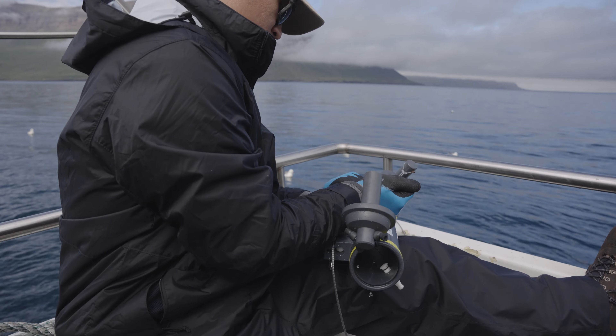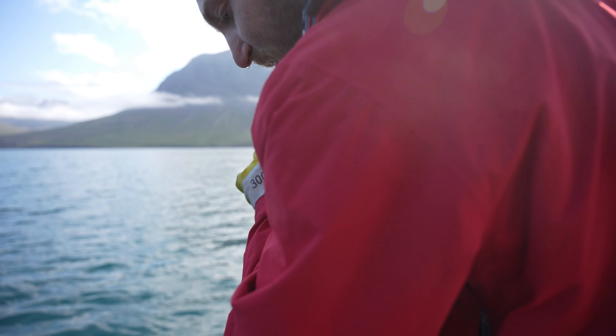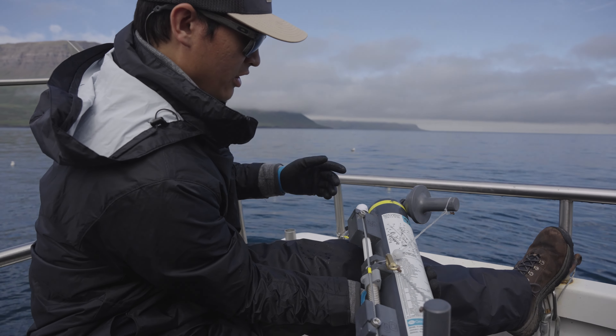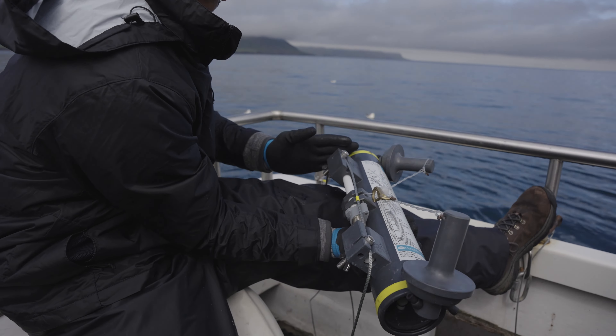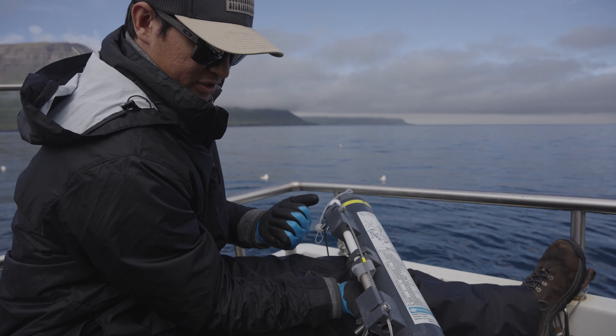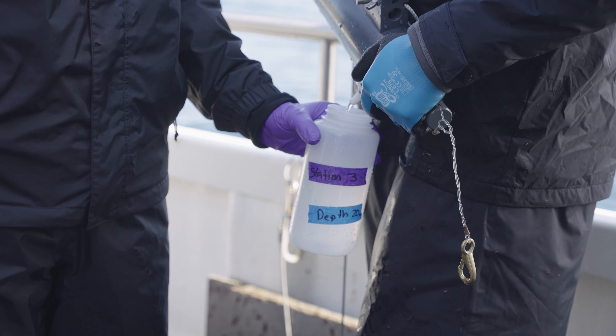To actually capture the water, these open up and clip, and then there's a weight that we drop. I'll show you what it looks like without me losing any fingers — the weight drops right here and the top and bottom will snap shut, concealing the water on the inside. Then we reel it back up.